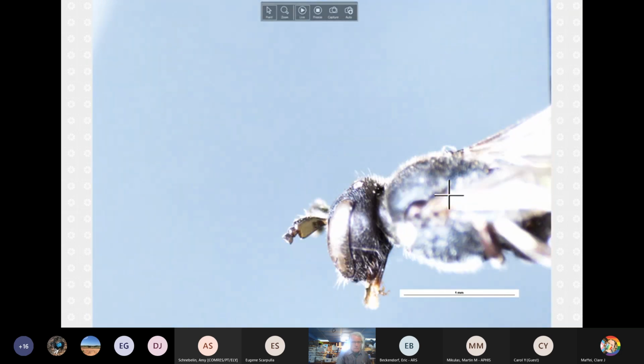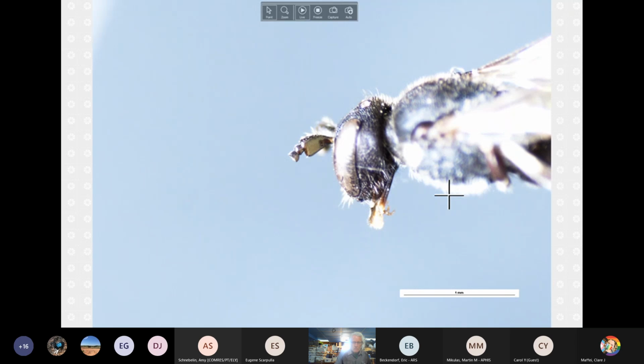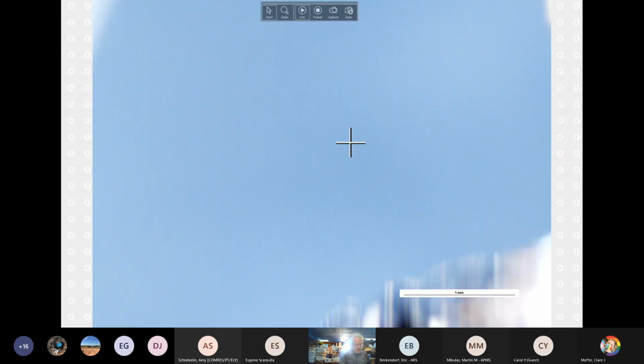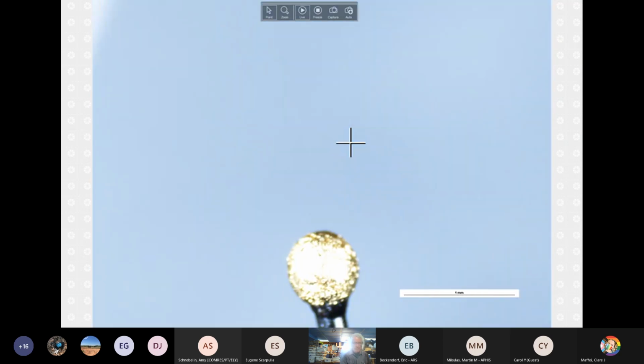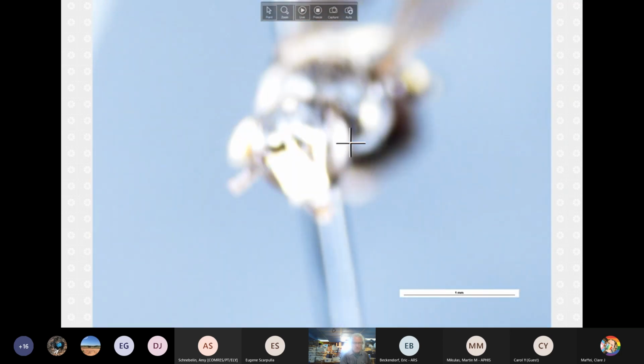Okay, so we're looking at, oh, that's actually an interesting shot here. So we're looking at Hylaeus. What are we looking at? Annulatus. And here we have a very clearly wide scape. We're looking at it in a view that normally you wouldn't look at, which is from the back side. And here it appears to be all yellow. We'll turn it around and look on the front side, and it should be half and half. But massively wide, though not as wide as we see in basilis.